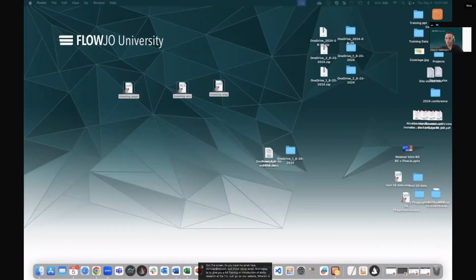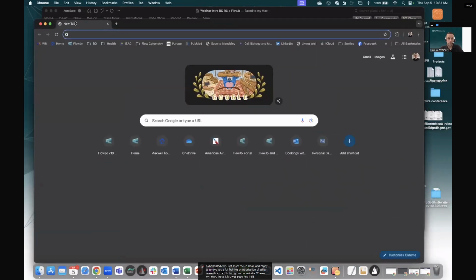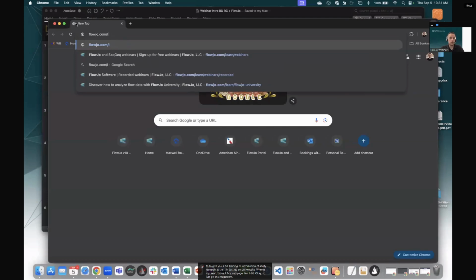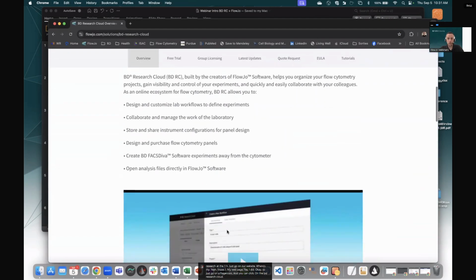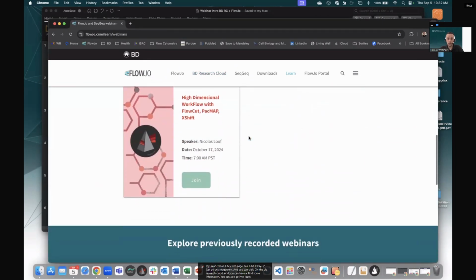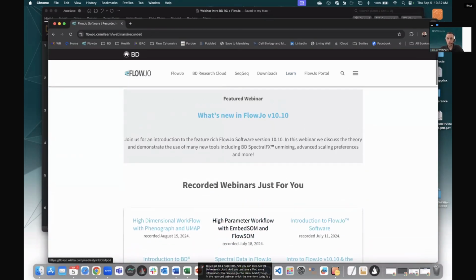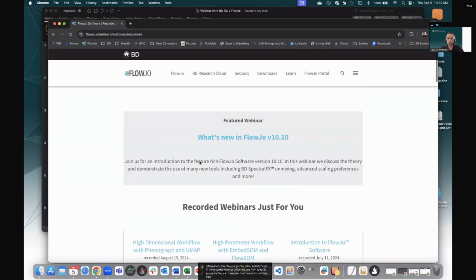Where's my, did I close my web page? Yes, I did. Okay, so just go on flowjo.com. You can click on BD Research Cloud and get some information. You can also go to the Learn webinar, and if you go to the recorded webinar, which today's is going to be, you're also going to have the recorded introduction of BD Research Cloud as well.